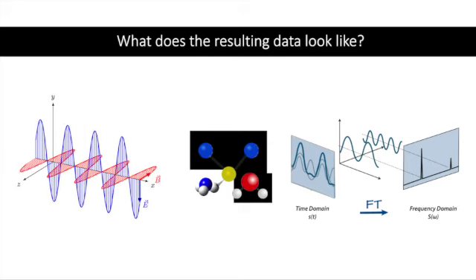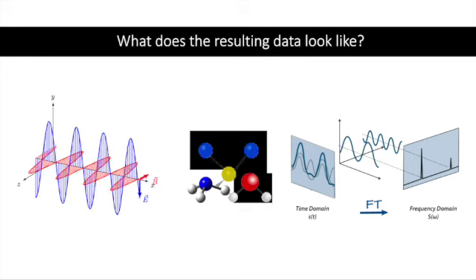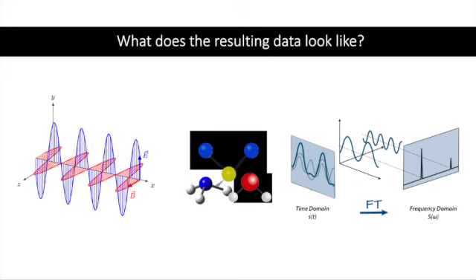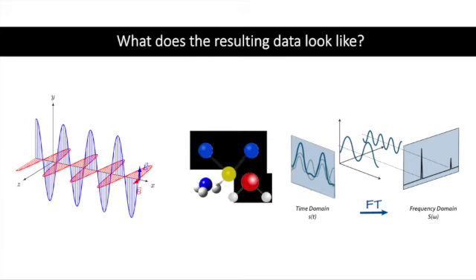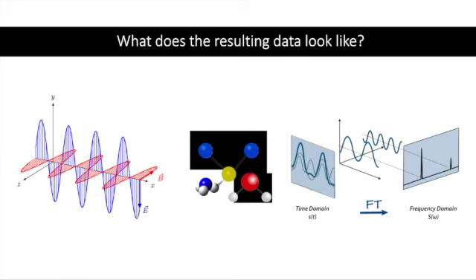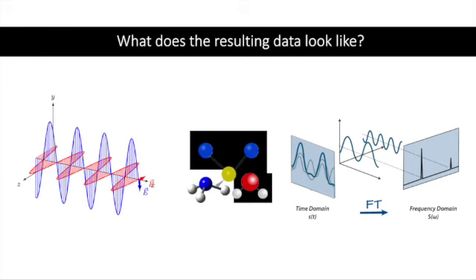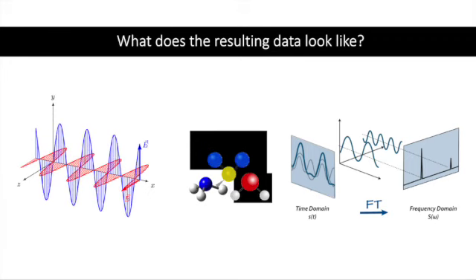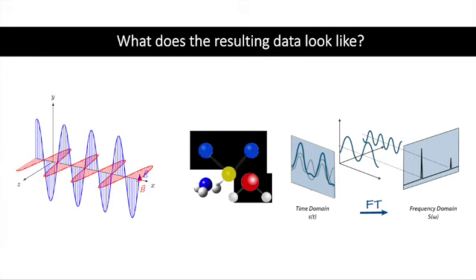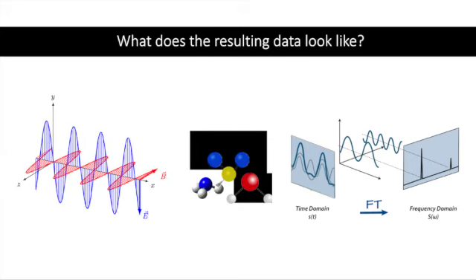Now, because of these resonant frequencies, the infrared will either be scattered or absorbed, resulting in the waveform being constructed or deconstructed, as there are multiple resonant frequencies at play affecting the outlook of the time amplitude signal or time absorbance signal.